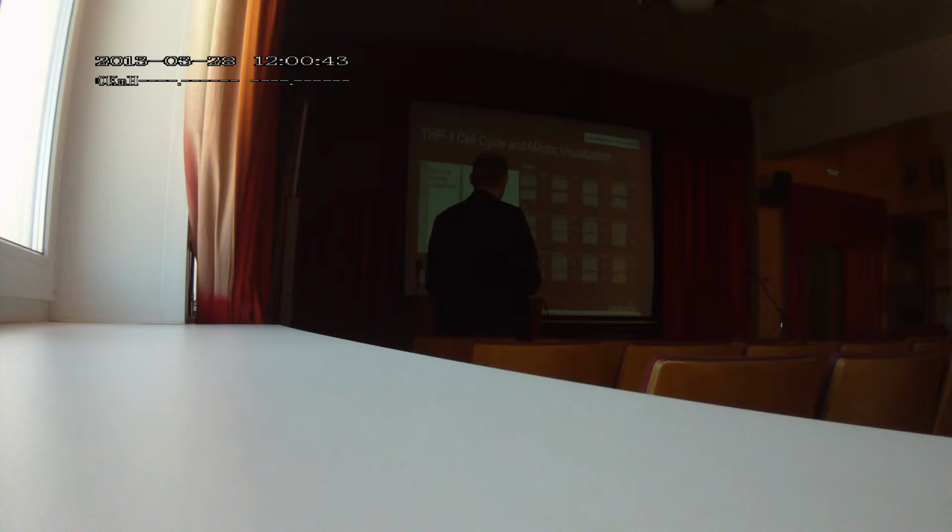This analysis was done using FlowJo on top of the data acquired here, with the percentages. So this is something the standard cytometry will give you as well.